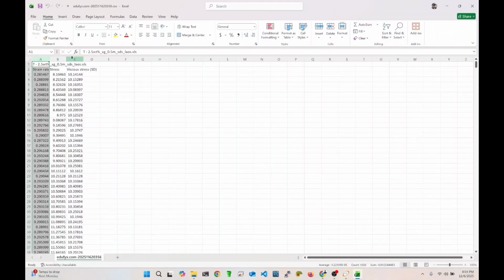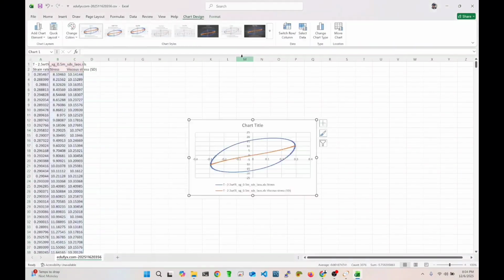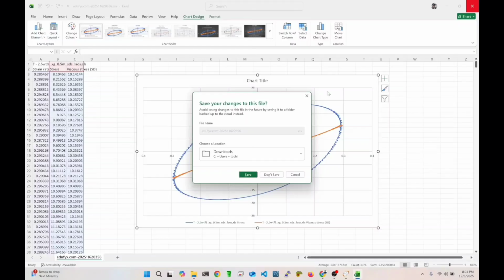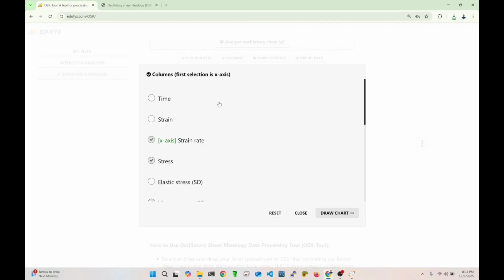Let me see if the spreadsheet can also make this kind of plot. So insert, no, I don't remember where the insert is. Insert chart, something like a line chart. Yeah, so I exported and plotted with the Excel spreadsheet. So you can basically export whatever you want. I don't want to save this. Let us try a few more parameters and then end.